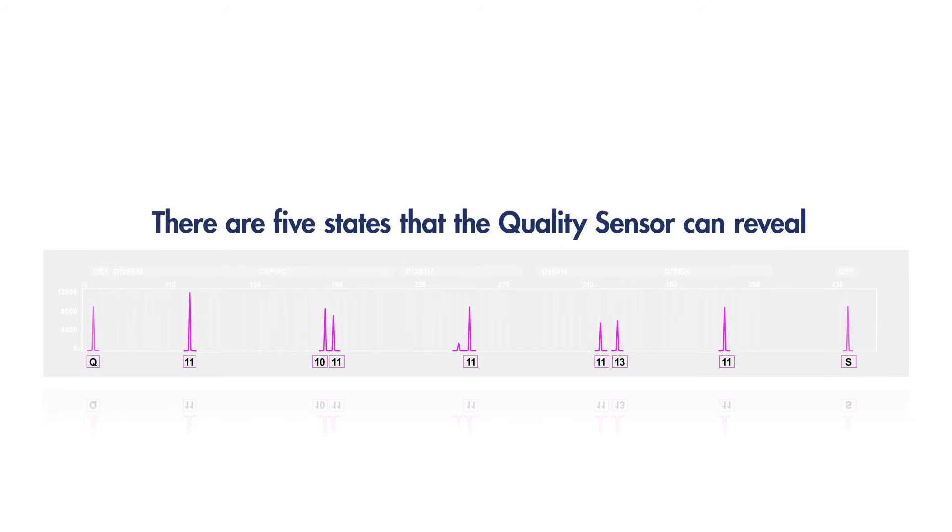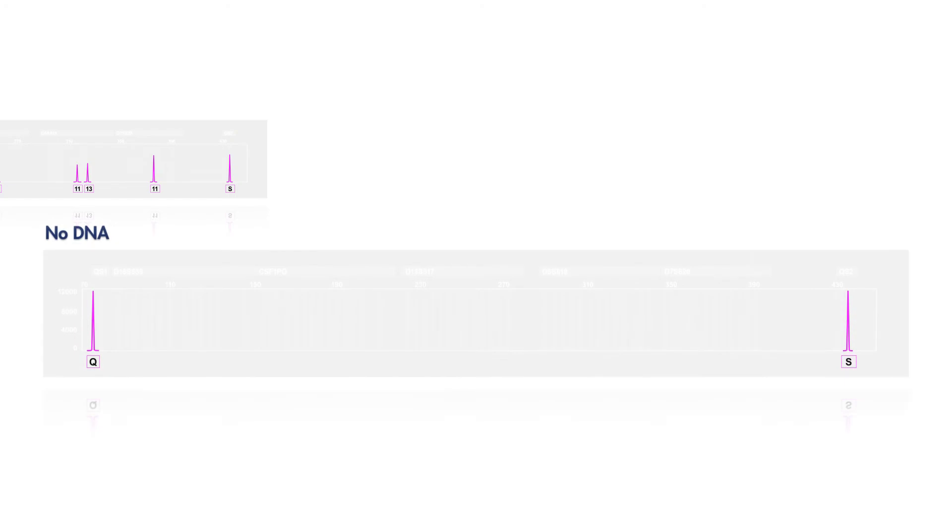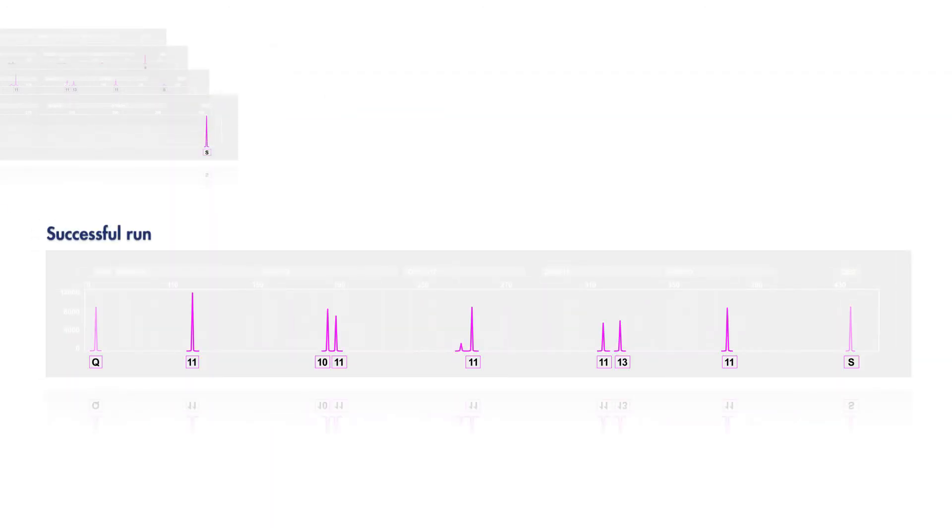There are five states that the quality sensor can reveal: a successful run, a lack of DNA, a failed PCR, inhibited PCR, or degraded DNA. Successful PCR with a good quality DNA sample gives a high quality balanced DNA profile with two balanced quality sensor peaks. When you see this result, you know you can move straight to data interpretation.